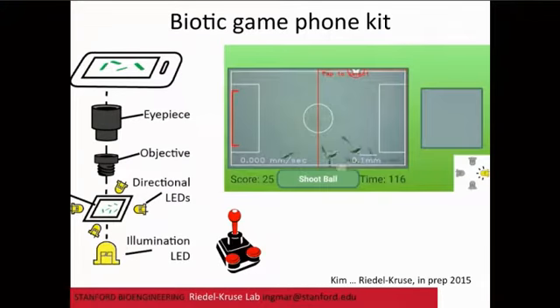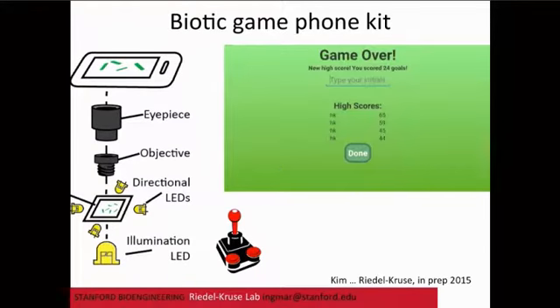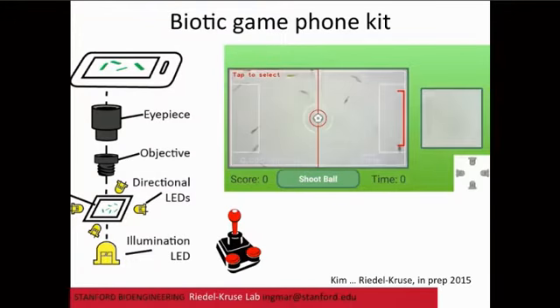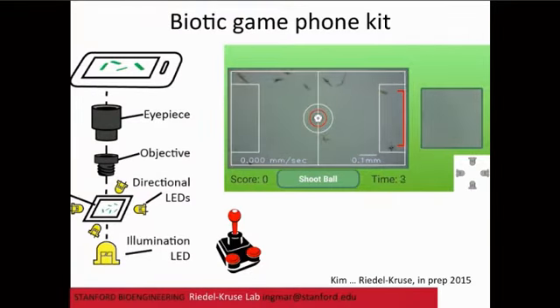And we also already integrated a number of things that are directly educational. So you see a scale bar here, and you see the velocity down here of any cell that is swimming through this object.